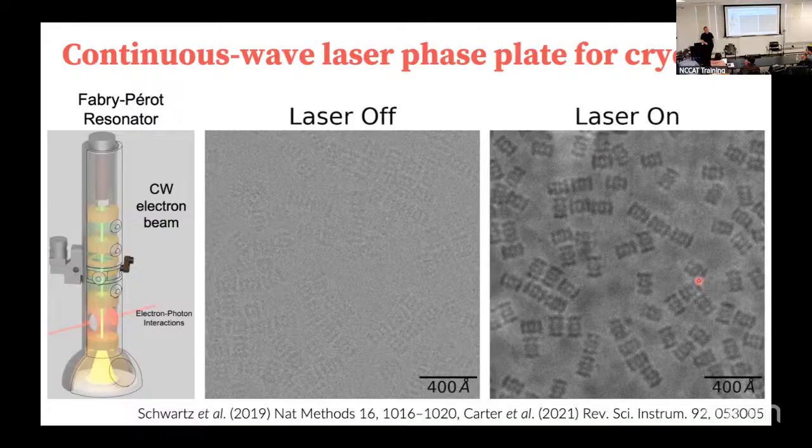Right. So our SEM was only 30 kilovolt. So we have to go up by, in principle, an order of magnitude to 300. But our test microscope would be 200 kilovolt, which is, once you're at 200, pretty much the same. Yeah. Any other questions?